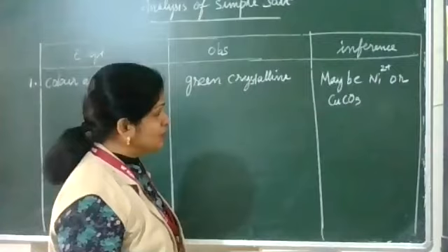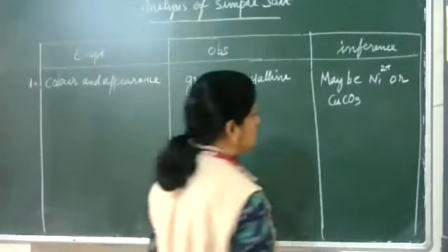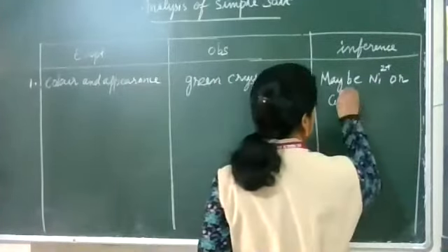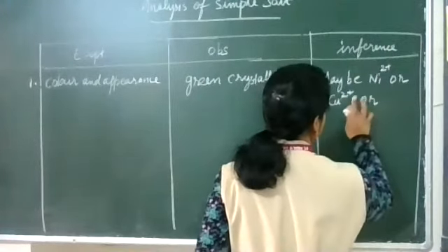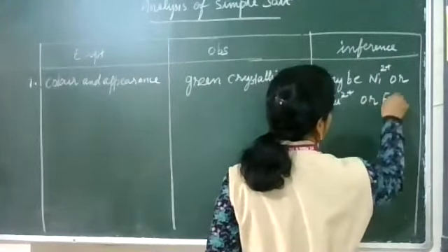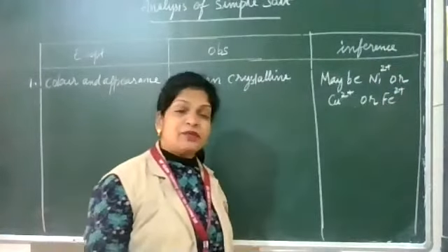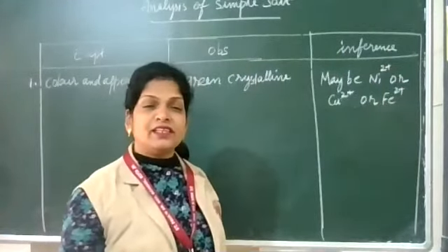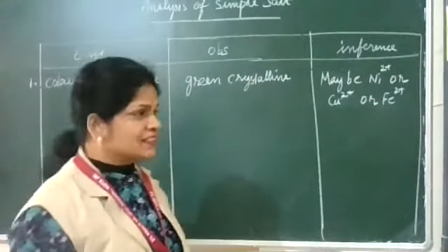Maybe Ni2+ or CuCO3. You can write Cu2+ or Fe2+, which is also green in color. But Fe2+ green is a very light green, sea green.